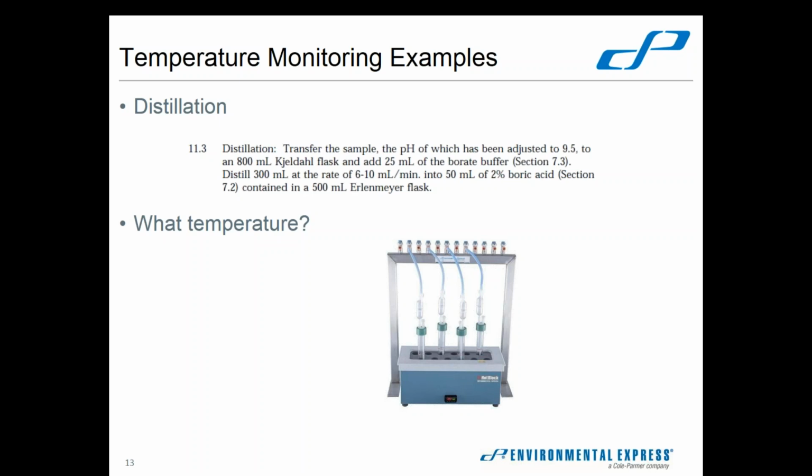It never tells us what temperature we distill the sample at. I've looked at all the distillation methods that I could find. I looked at phenols, I looked at cyanides, I looked at ammonia, I looked at Standard Methods, EPA methods, everything that I could find, and none of them actually have a temperature requirement.